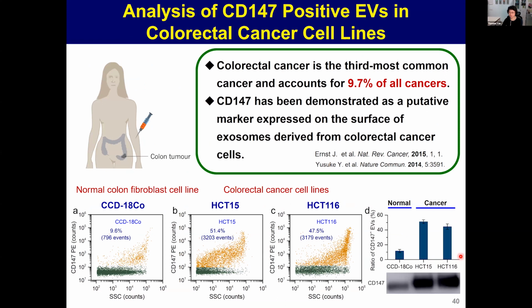I really want to highlight that you will need a large quantity of cells in order to extract EVs for the Western blot analysis. But we only need 1/50th of the amount you need for Western blot analysis. That is enough for a nano-FCM experiment.